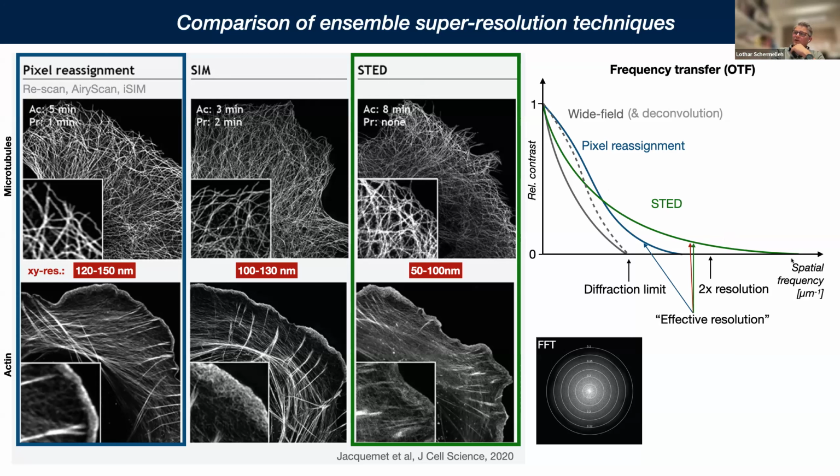So you can get out to very high spatial frequencies, and theoretically there's no limit to it.